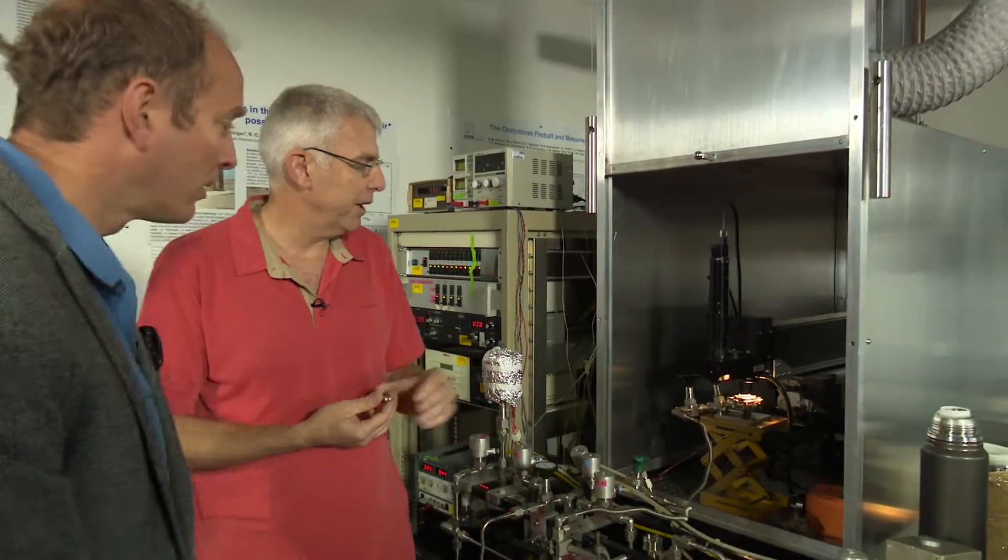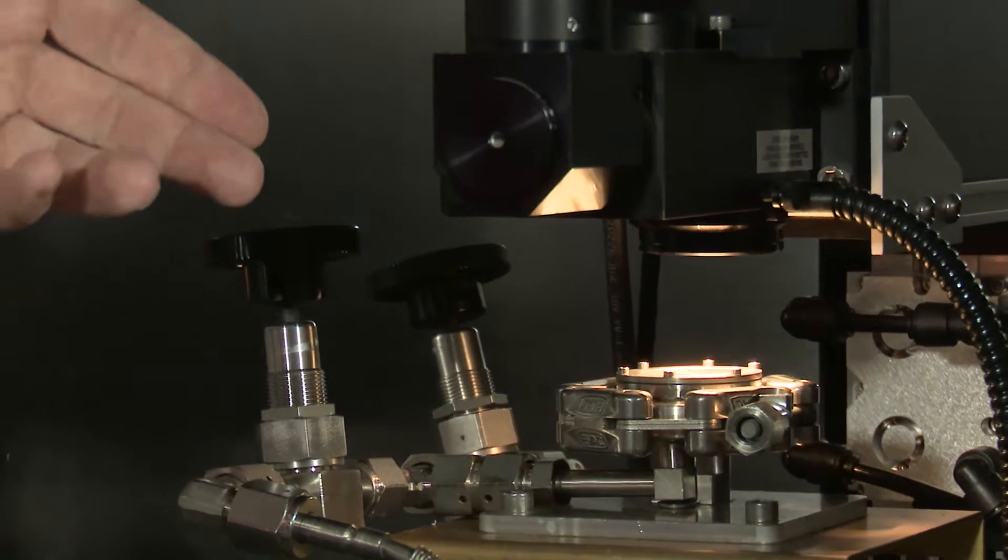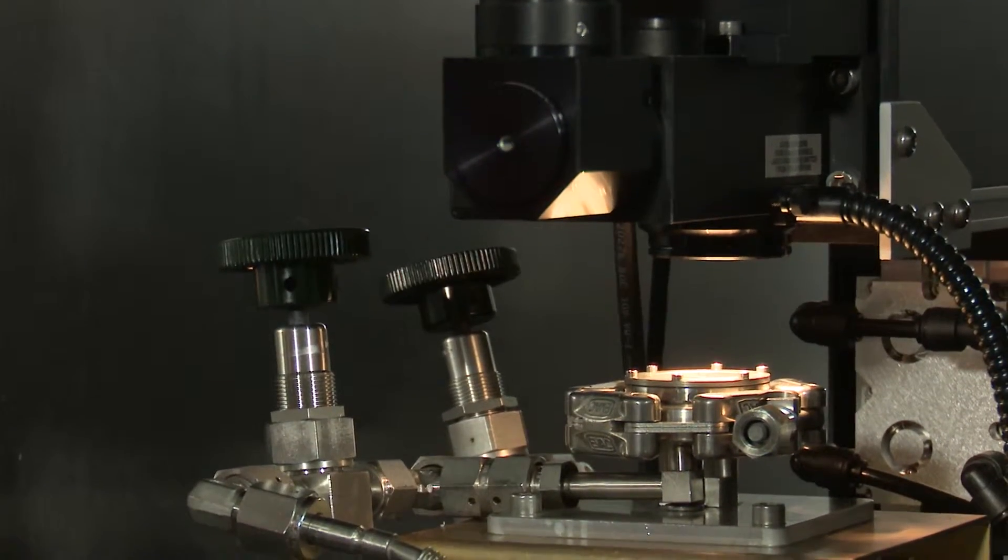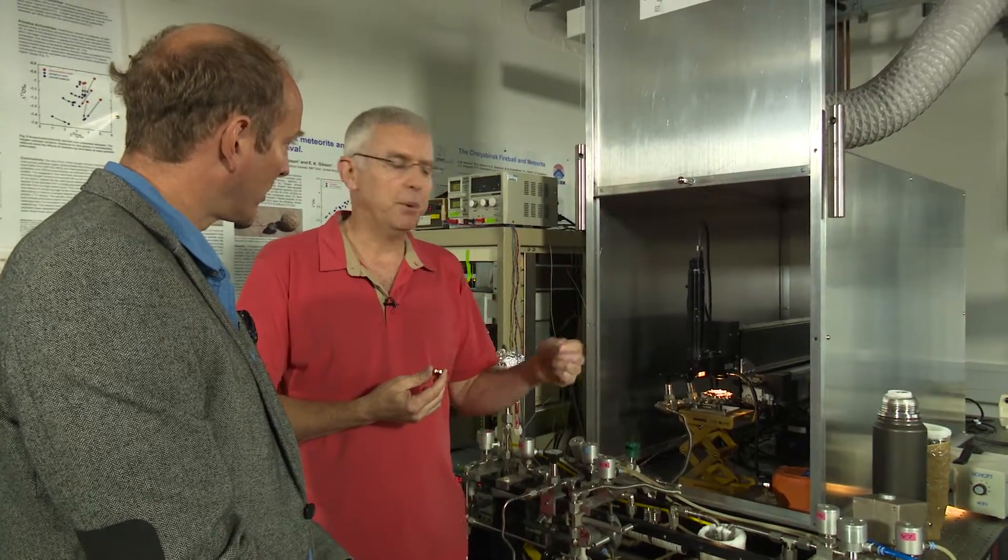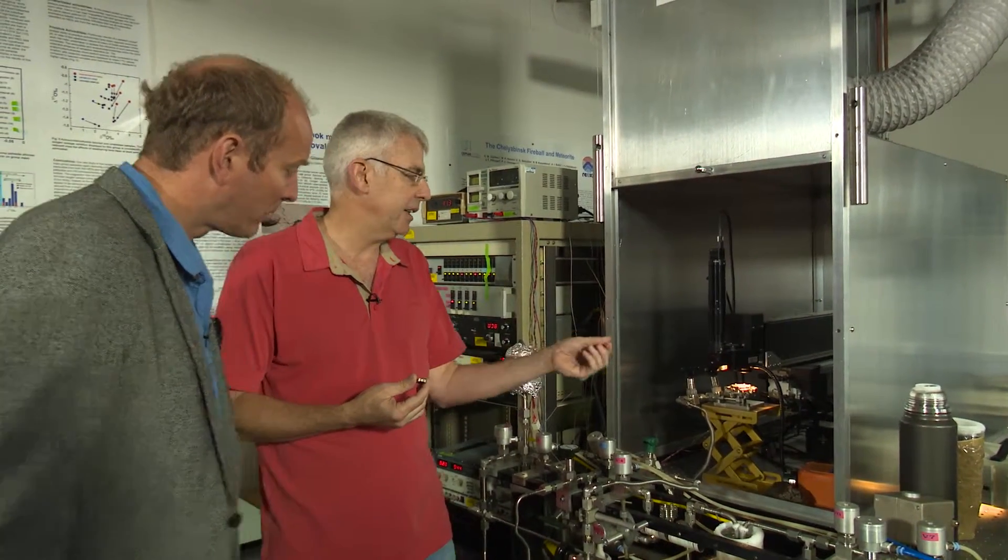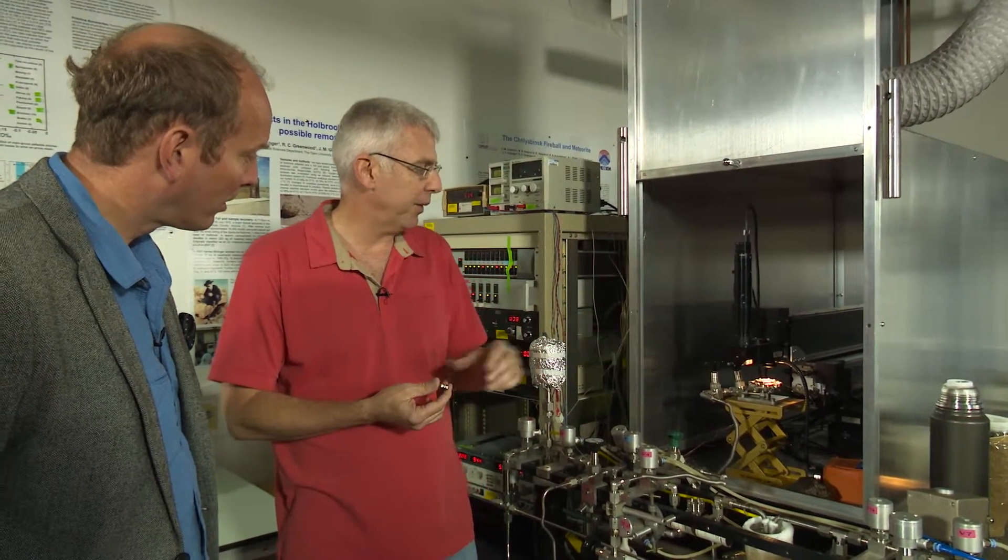The samples are then loaded into the sample reaction chamber which sits under the laser here. This is a CO2 laser that can drop down up to 50 watts onto the actual sample itself to heat it up. But that doesn't get the oxygen out of the sample. We have to react the sample with bromine pentafluoride, a very powerful oxidizing agent. That liberates all the oxygen out of the sample at the high temperatures we can achieve with the laser.